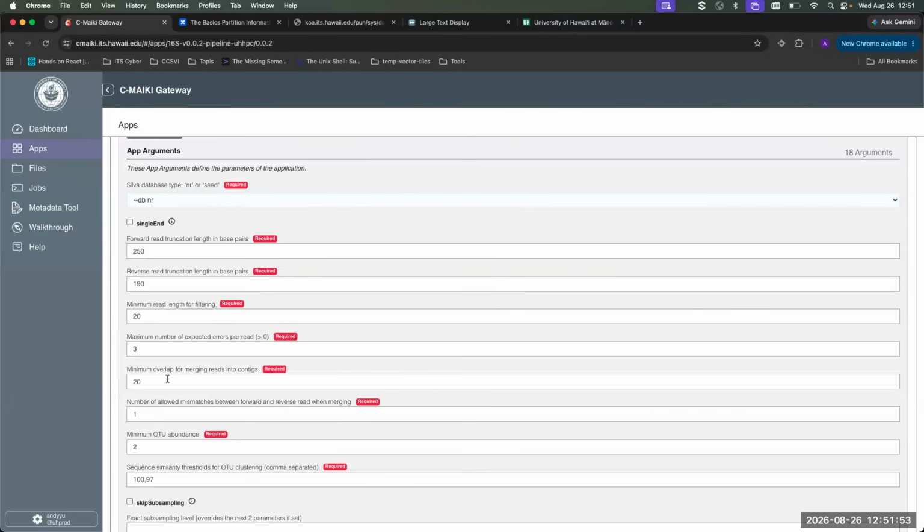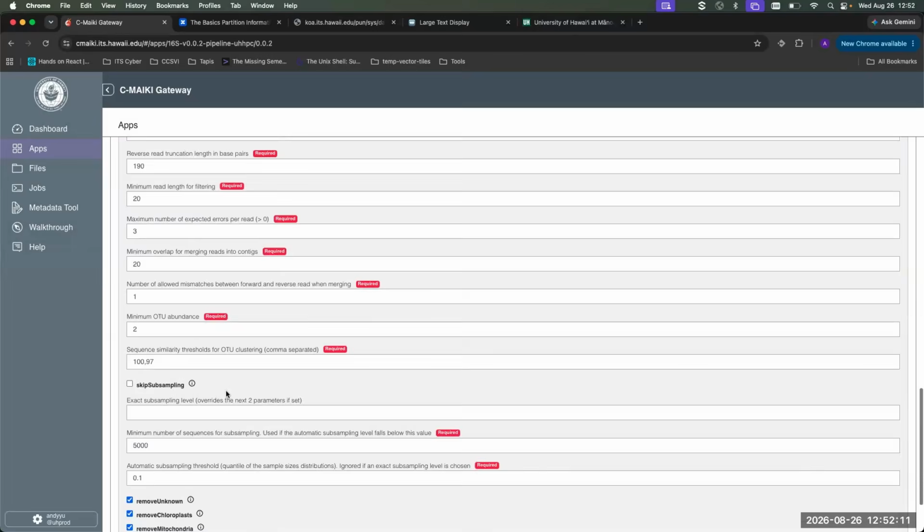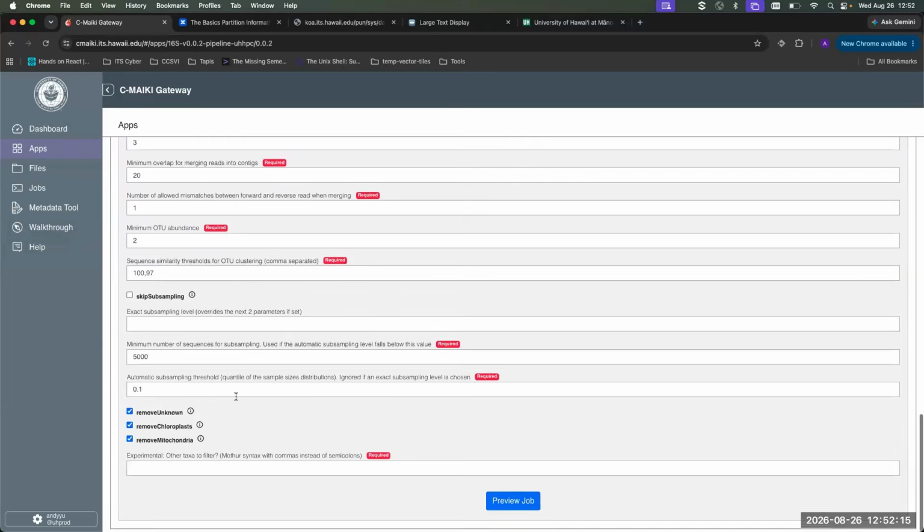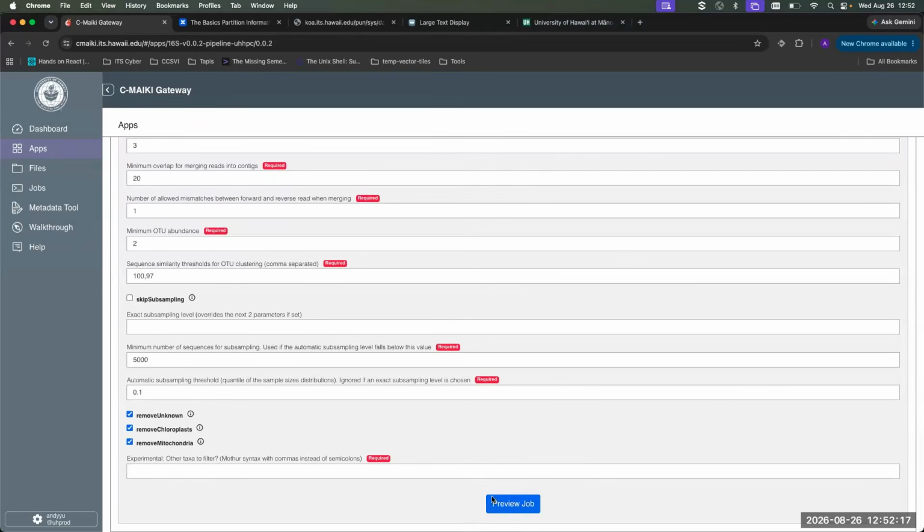Unfortunately, I myself cannot provide much guidance on that, but we do have, again, help documentation. Each of these pipelines, the original one, 16S, ITS, DMUX, et cetera, have their own documentation. Ampliseq, if you are delving into that territory, is a very well-documented pipeline used through the community. I think that's, for the most part, job submission.